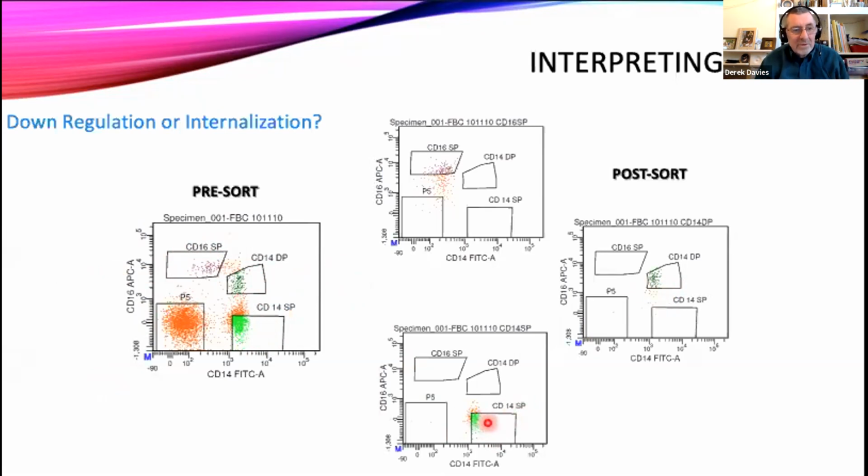And as we discussed before, this is mainly due to mathematics. A cell, just because it was inside that box when it was first run, could quite easily be slightly outside when we rerun it. But this looks pretty good. So does this. But here we're seeing quite a lot of reduction in purity.